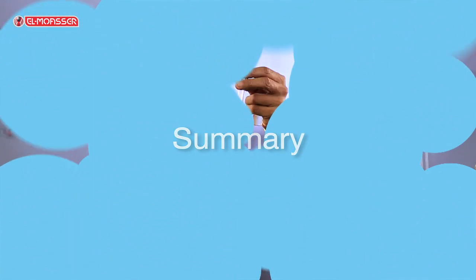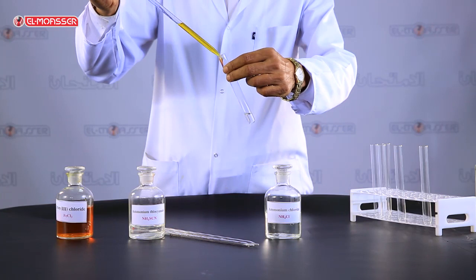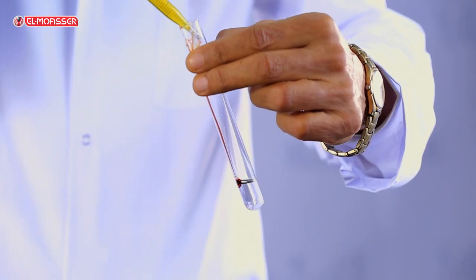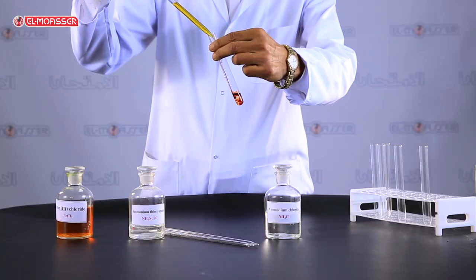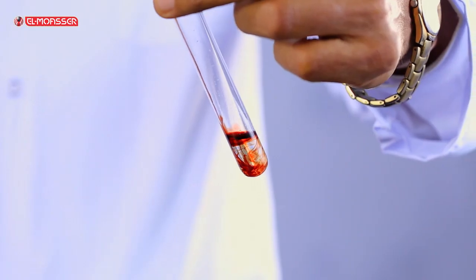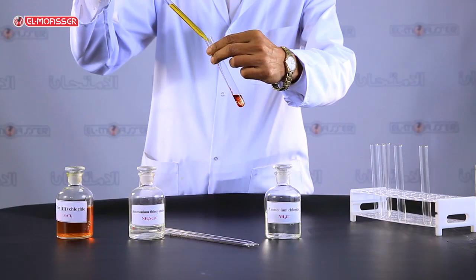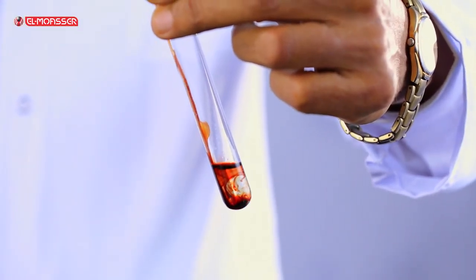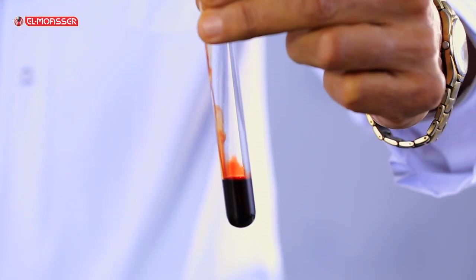Summary: On adding pale yellow iron(III) chloride solution to colorless ammonium thiocyanate solution, the reaction activates in the forward direction, which is detected by the solution changing to blood red — the color of iron(III) thiocyanate. The intensity of the red color increases by increasing the concentration of iron(III) chloride solution.